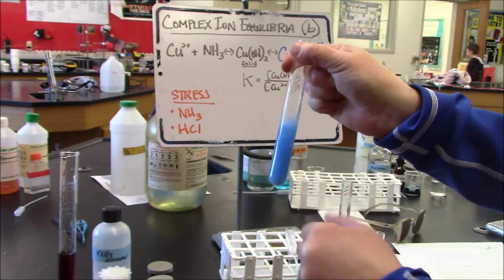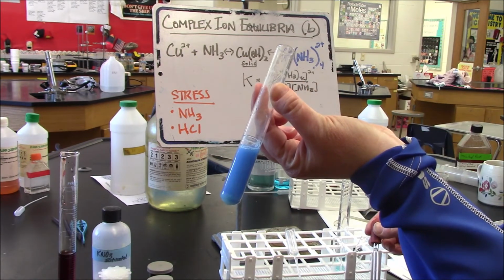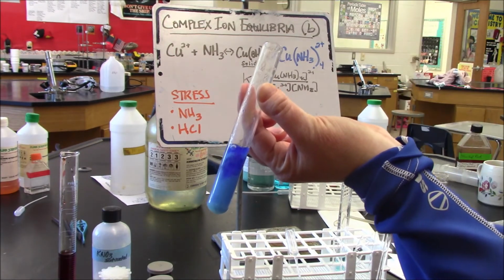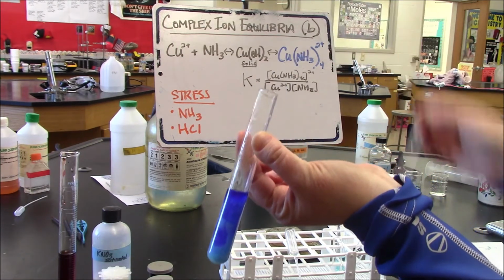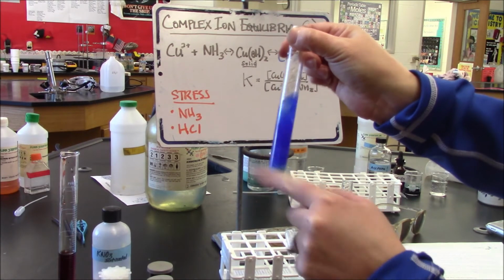It's almost there. But I want it to get to the deep blue color that it's supposed to be. Okay, it's really pretty to look at.